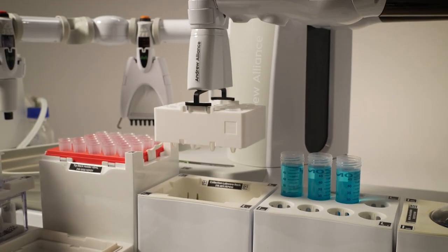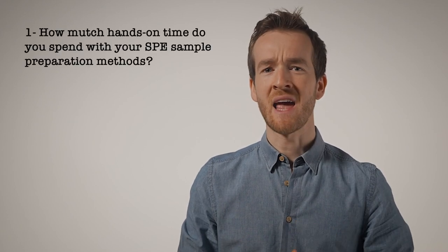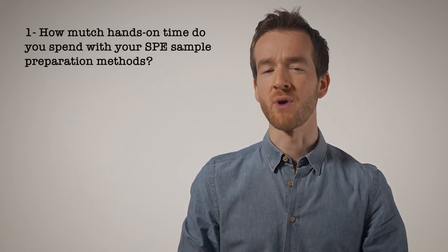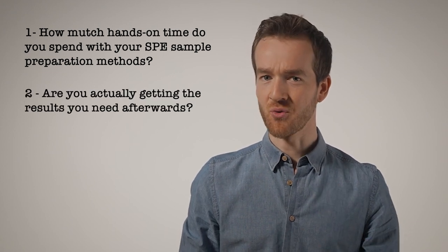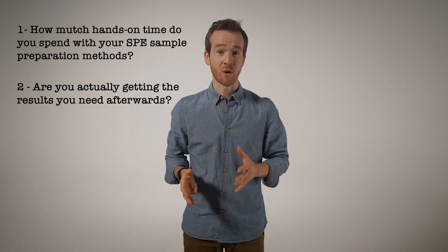Now, everyone has a specific reason for wanting to improve lab processes, but let's focus on yours and how the Extraction Plus device can help you. First, let me ask you: how much hands-on time you spend with your SPE sample preparation methods, and are you actually getting the results you need afterwards?